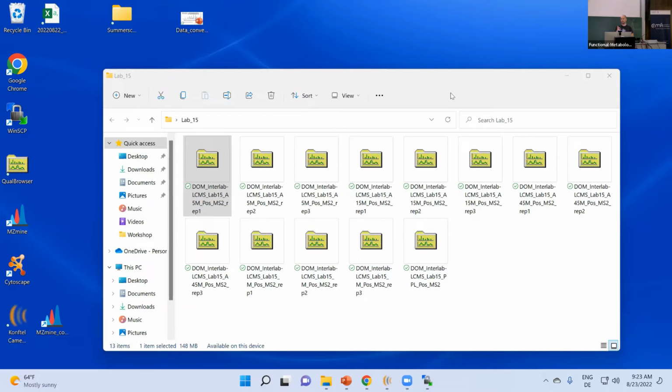If you have an internal standard, you can also use the internal standard for that, or in studies where we did not have internal standards, we used housekeeping features. So that's features that we assume to be in every sample, right? Like, I don't know, phenylalanine or something like that. And then we would look for the retention time and mass deviation there.